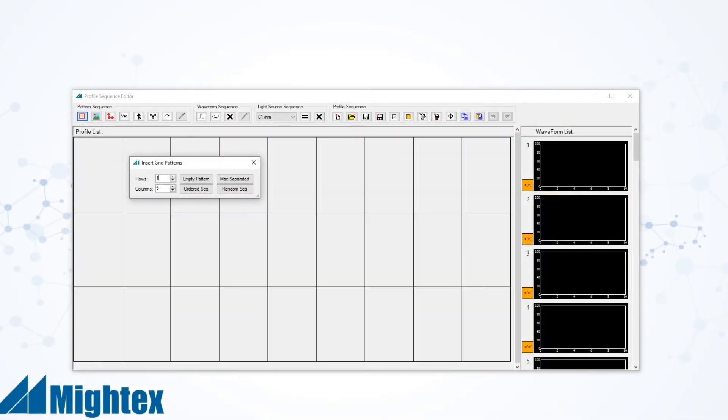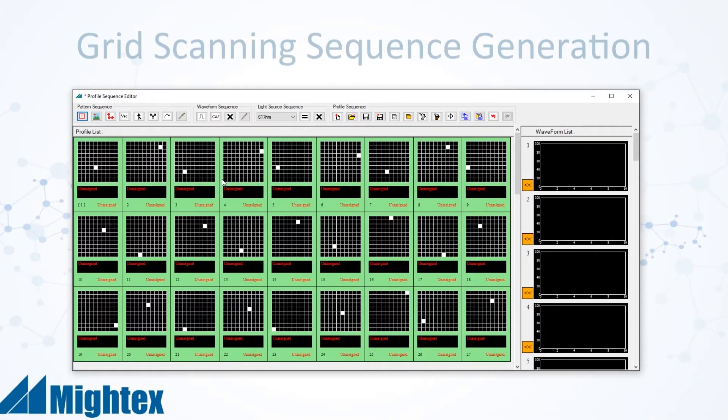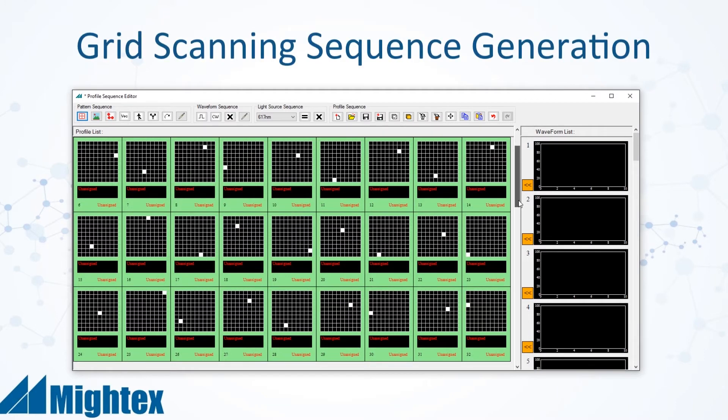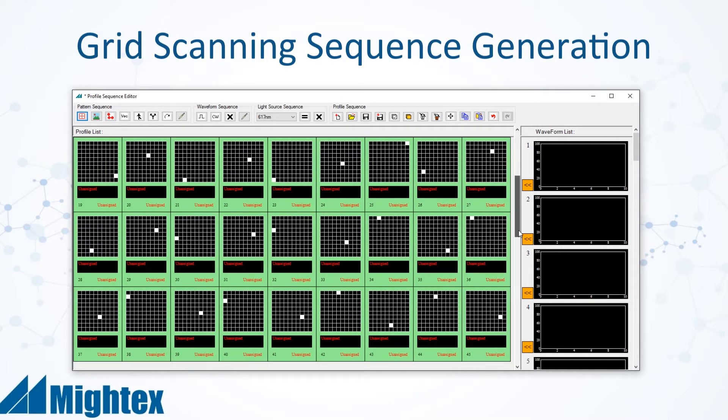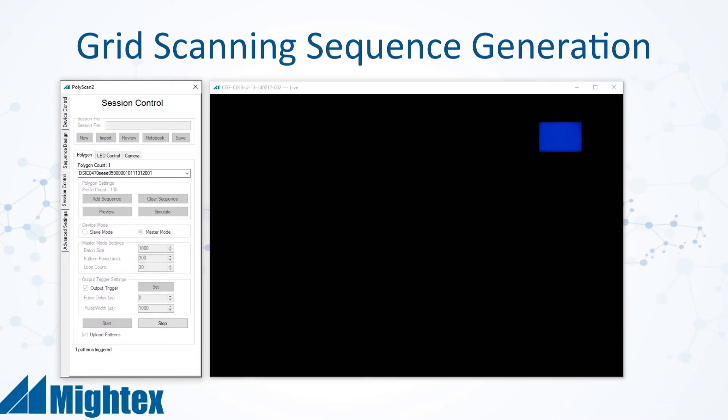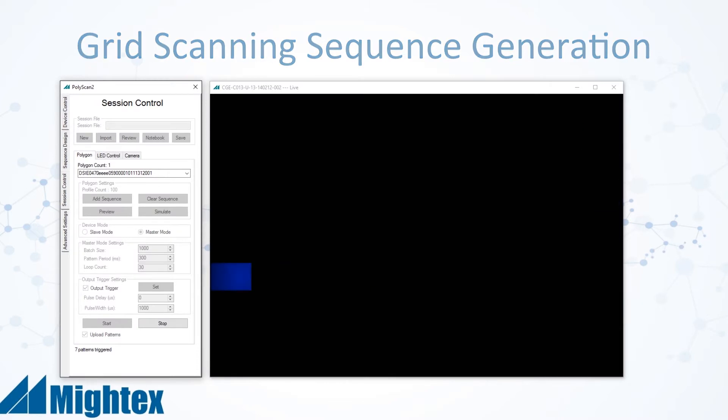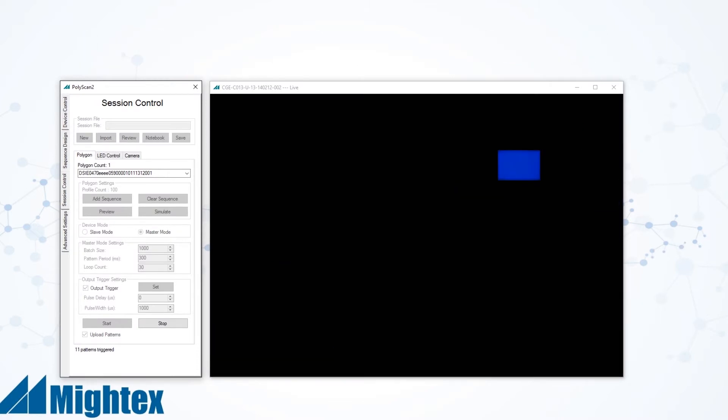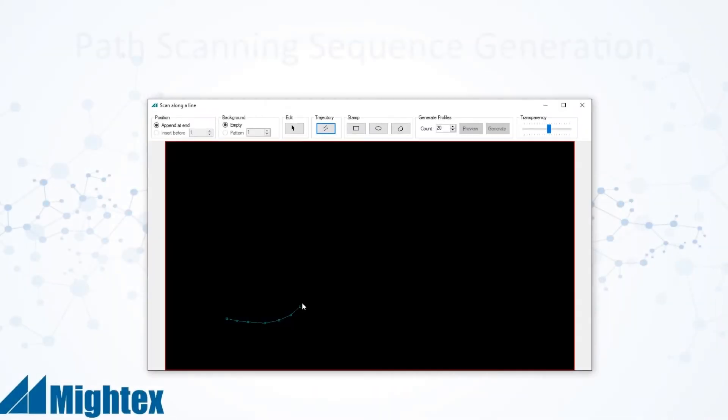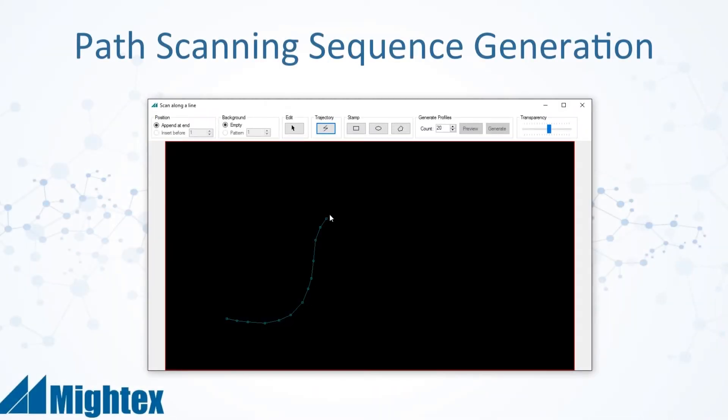PolyScan also includes tools for automatic generation of popularly used sequences found in neuroscience and optogenetics such as grid scanning to sequentially scan light across an entire area of interest, as well as path scanning to scan a pattern of light along a trajectory.